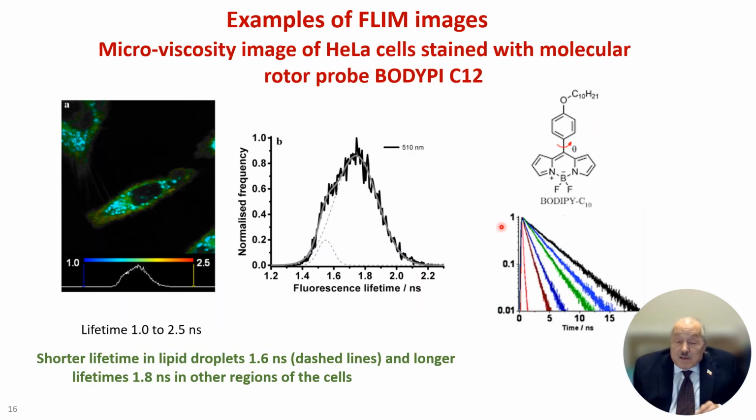So let's look at some examples of FLIM images. You might remember from an early lecture that the BODIPY probes were viscosity probes. We called them molecular rotors because when in low viscosity, they would rotate and the lifetime would drop. In higher viscosities, they would not rotate as much and the lifetime would be longer. So here's a microviscosity image of a HeLa cell done by FLIM. So it's color coded rather than intensity coded.